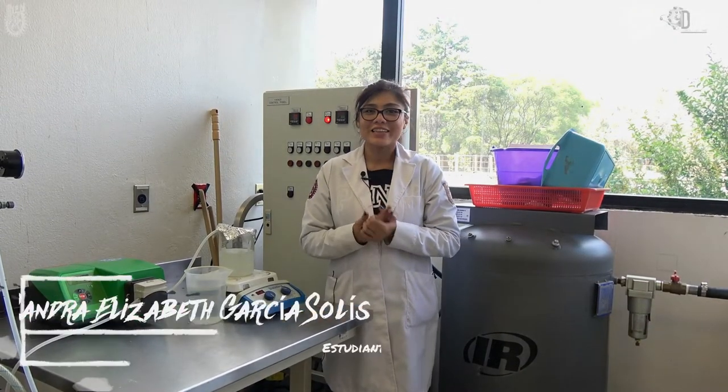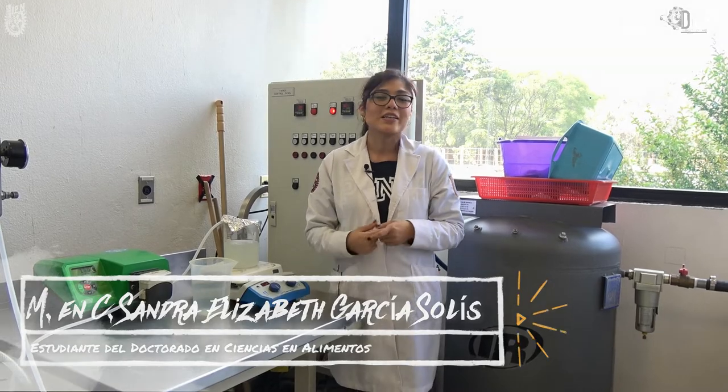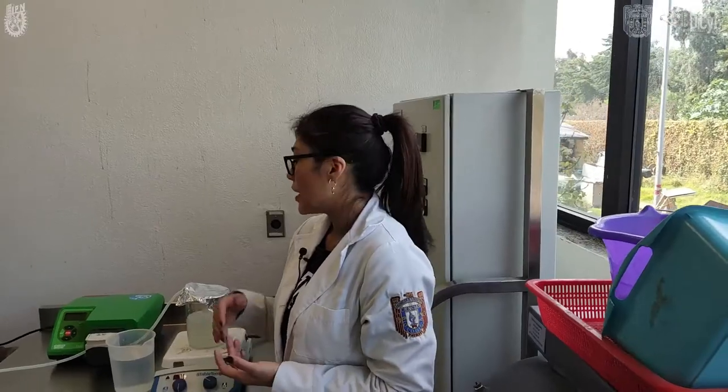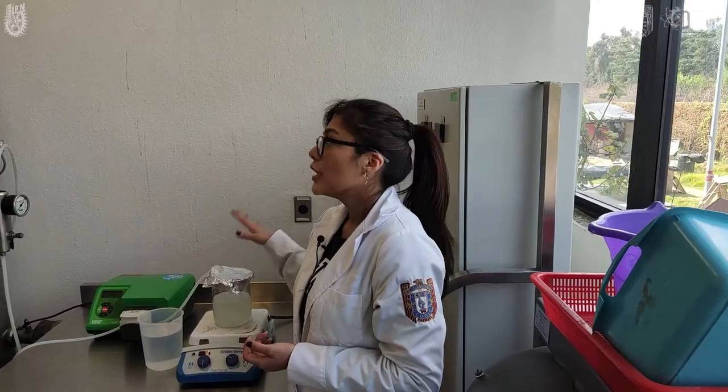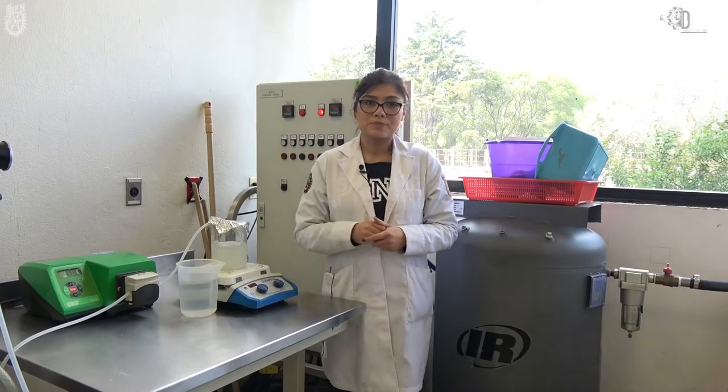Hola, yo soy Sandy, estudio el doctorado en ciencias en alimentos aquí en la Escuela de Ciencias Biológicas del IPN. Nosotros en el laboratorio estamos llevando a cabo trabajos de microencapsulación mediante secado por aspersión y, a continuación, les voy a hablar sobre el proceso que llevamos a cabo.